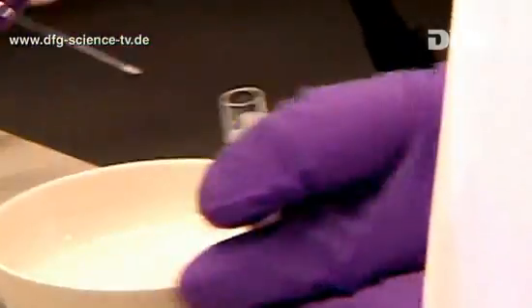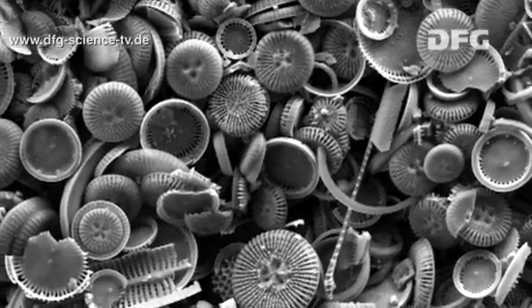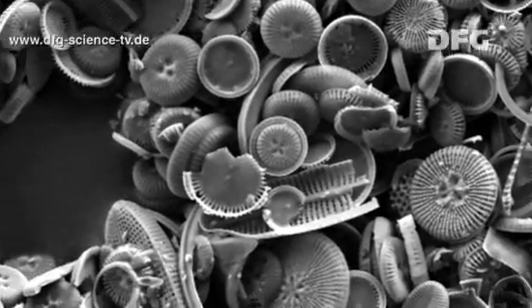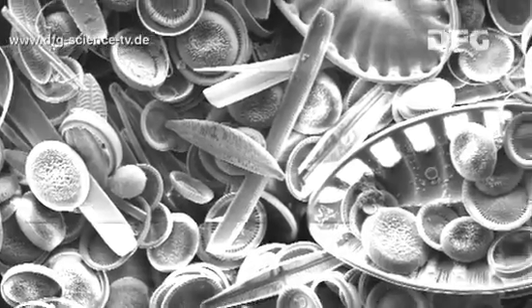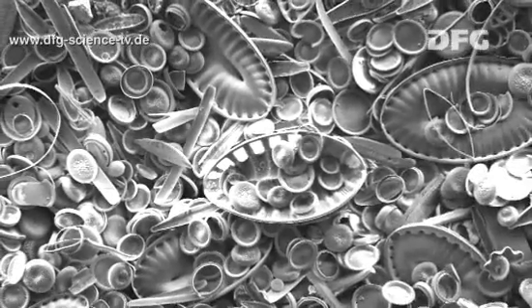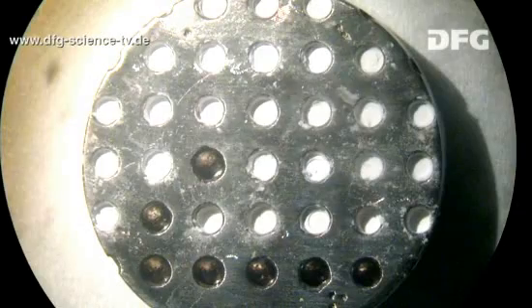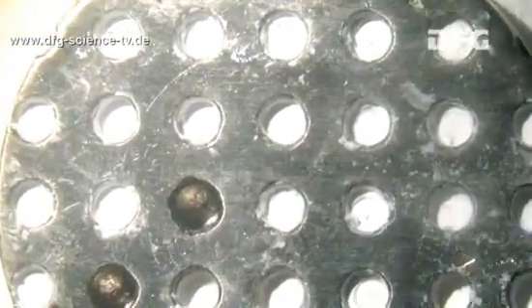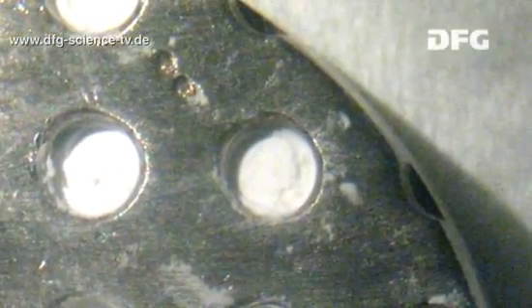The dry, pure diatom powder is filled into small vials and weighed. Here it's already possible to see whether it was taken from sediments from a warmer or a cooler phase. The warmer the climate, the more diatoms are produced, and the higher the bioproductivity. A nickel plate is prepared by adding powder from several diatom samples. The doctoral researcher also adds standards, which provide reference data.